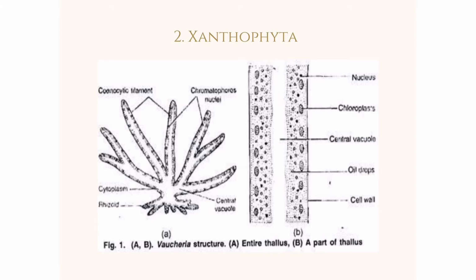In the peripheral part of the protoplasm are present a large number of small oval or disc-shaped chloroplasts which lack pyrenoids. The chromatophores of Vaucheria contain pigments: chlorophyll A, chlorophyll E, carotenoids, and an unknown xanthophyll. The pigments in Vaucheria are like those of Xanthophyceae. Chlorophyll B, the characteristic pigment of Chlorophyceae, is absent. Many small nuclei lie in the cytoplasm inner to the layer of chloroplasts. The arrangement of nuclei with respect to chloroplasts is reversed at the time of zoospore formation.